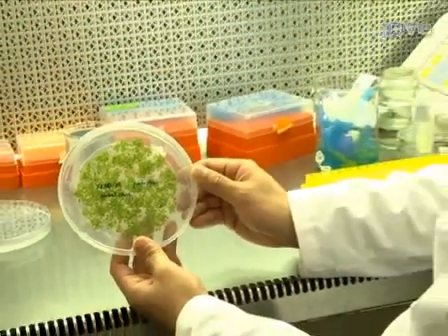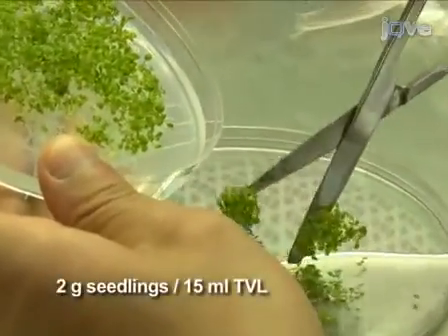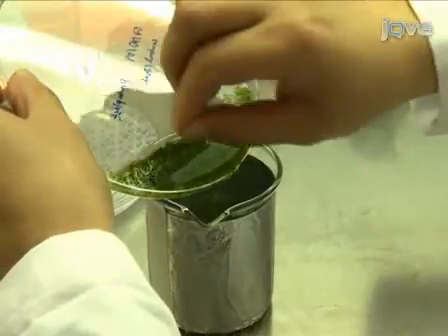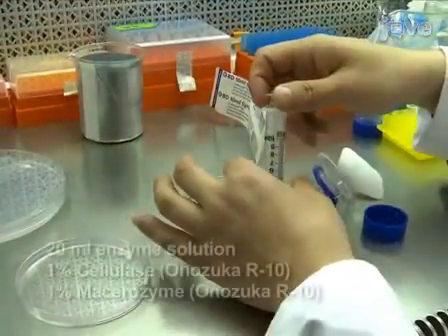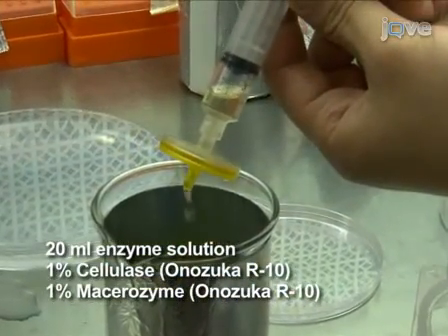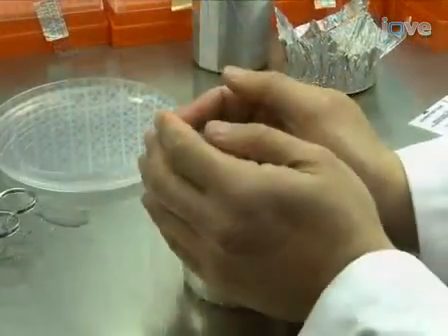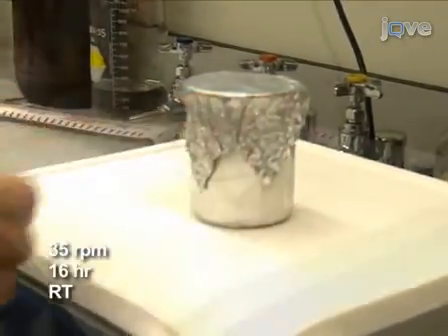Now that the seedlings have grown for two weeks, it is time to prepare the protoplasts. In the hood, use a fresh razor blade to slice 2 grams of seedlings in 15 milliliters of filter-sterilized TVL solution in a petri dish. Next, transfer the chopped tissues into a 200-milliliter beaker wrapped in aluminum foil. Add 20 milliliters of freshly prepared filter-sterilized enzyme solution to break down the plant cell wall. Swirl the beaker to mix, and cover with parafilm and aluminum foil to keep the tissue in the dark. Shake the plant tissues in the enzyme solution for 16 hours at room temperature.